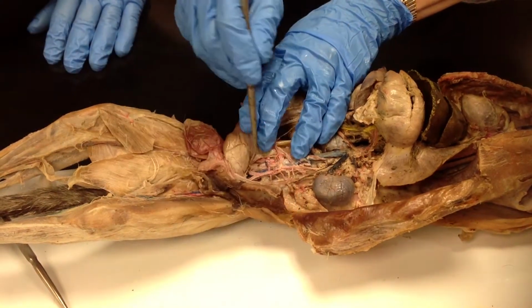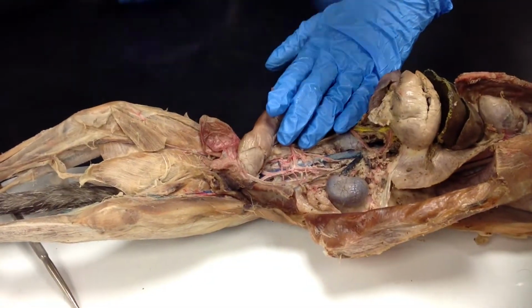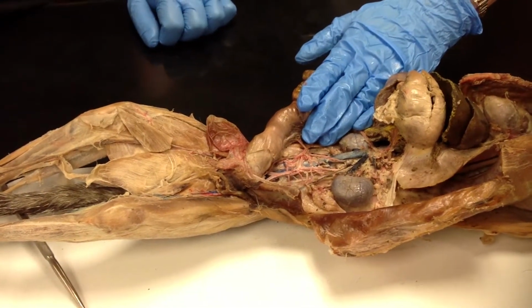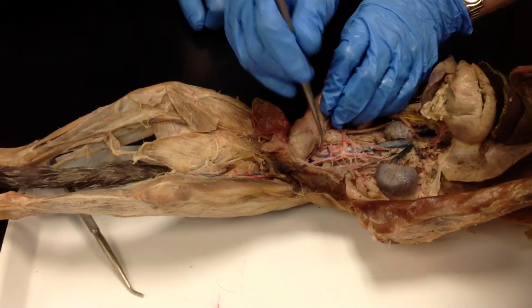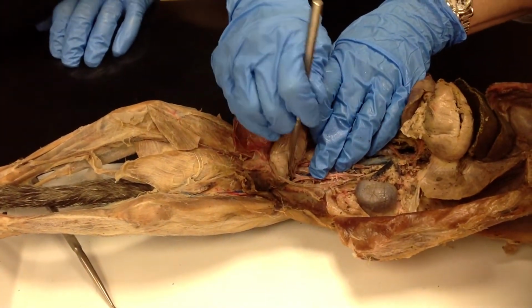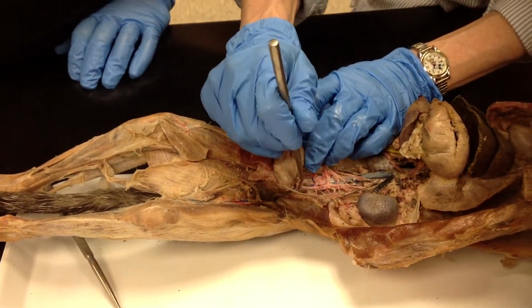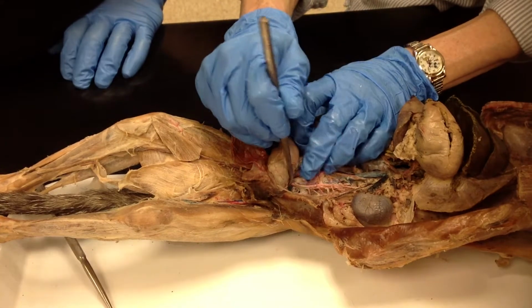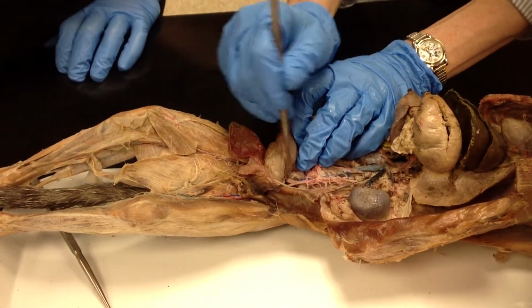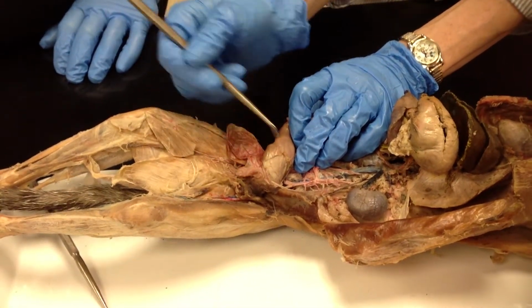Alright, so now we're at the bottom. And at the bottom we branch, because we have two legs. So both the veins and the arteries branch at the bottom. So now we're right here. So we're at the common iliac veins, which, you have to move the arteries aside. You can very gently move the arteries aside. I'm going to have to look under here, but take my word for it. Under here, it branches. You can see how the arteries branch, the veins branch the same way. And it goes down to the external iliac veins.